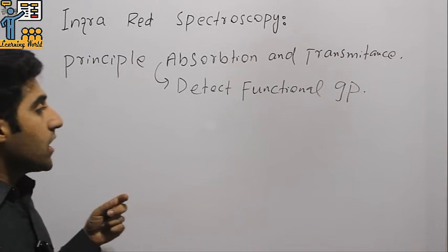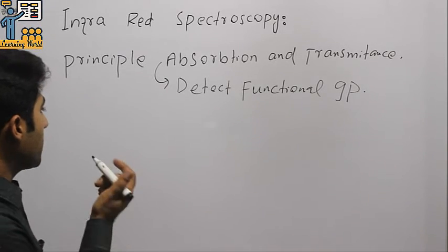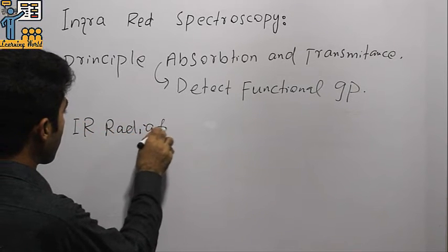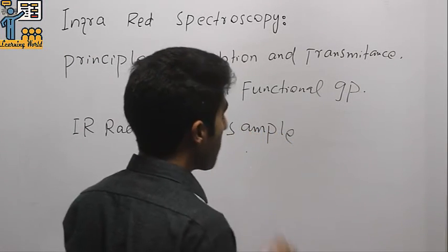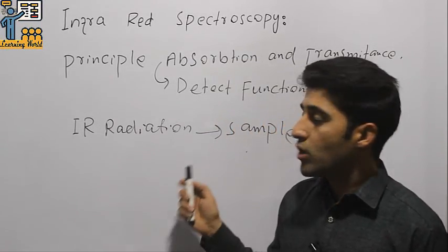First of all, if we bombard a sample with infrared radiation, the sample will absorb some wavelengths of radiation and some will be transmitted.